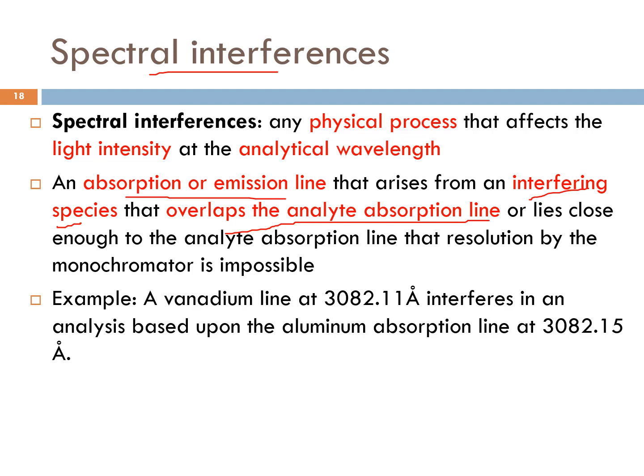Okay, contoh kata kita punya analyte of interest adalah aluminium yang absorption line dia akan muncul dekat 3082.15 angstrom. Ni wavelength dia lah. Tapi vanadium line juga muncul dekat exactly about the same wavelength lah. Okay, korang jangan keliru. Angstrom ni adalah unit. Kalau tukar ke nanometer, it will be 308.2 nanometer.